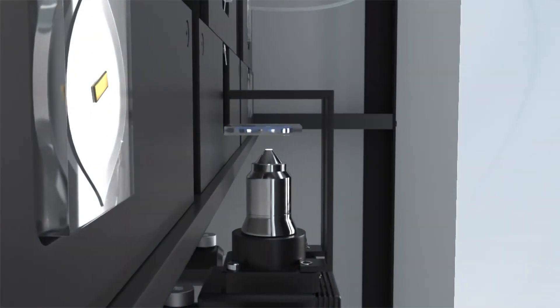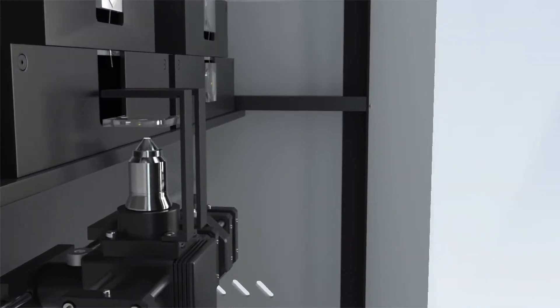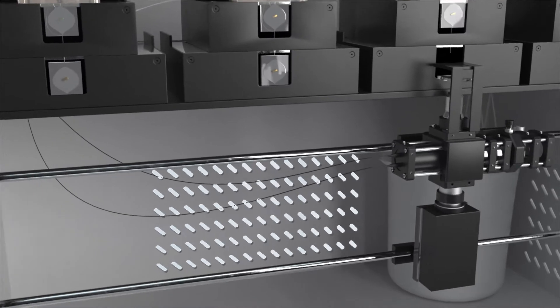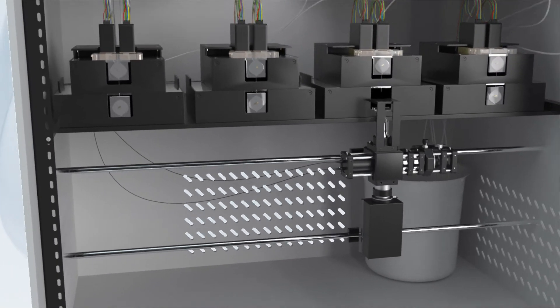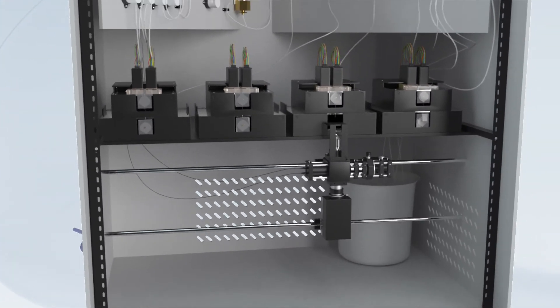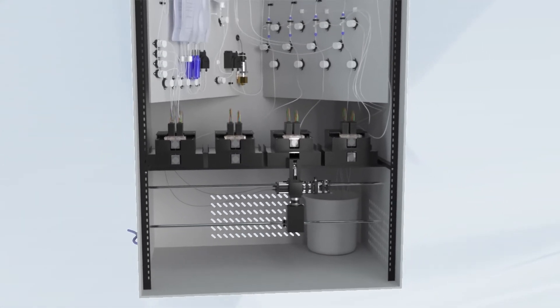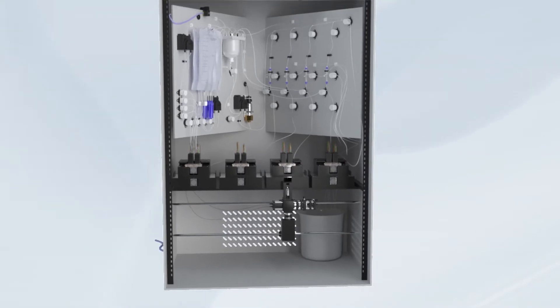In the last stage, the reader assembled by ICFO moves to fit with the reading cartridge. Then, it analyzes the sample through a newly designed cytometer based on a high-sensitive multipixel photon counter, also called MPPC, a sensor that detects and counts the labelled microorganisms.